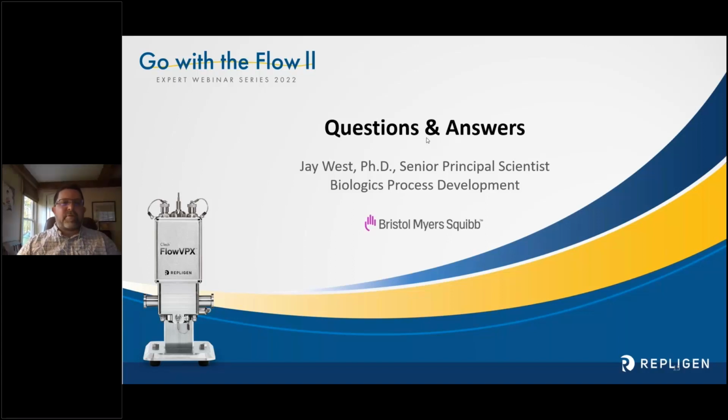But there are potentials. I know the people at Repligen have been working on this, and others, that you can start using the VPX as soon as the protein, because some people have been using it for protein breakthrough. It's good enough for that. I think it's because that is where you at least have separated the protein from the matrix, and you can do a pretty accurate protein concentration measurement once it's been protein purified.